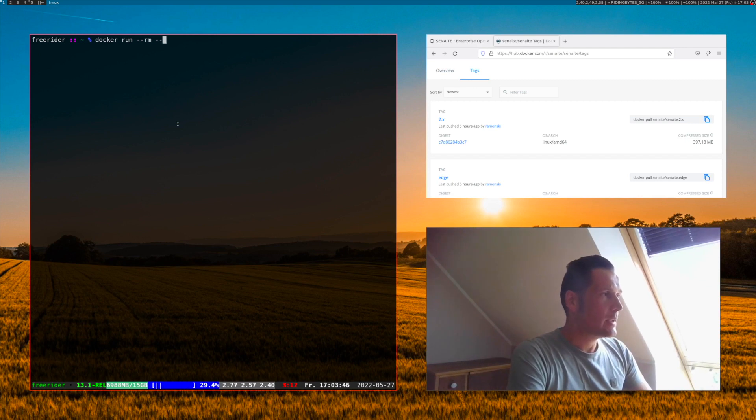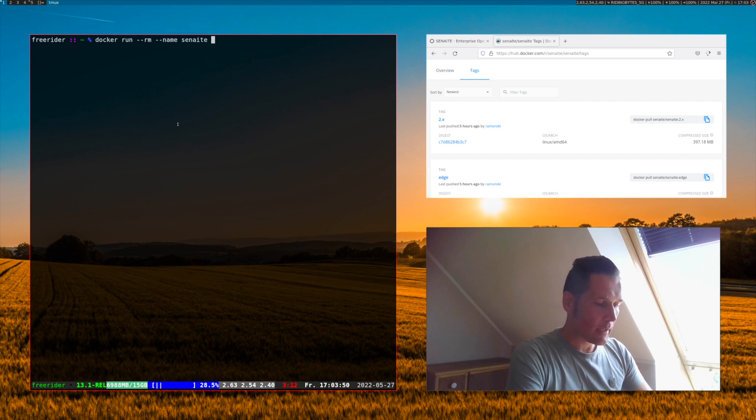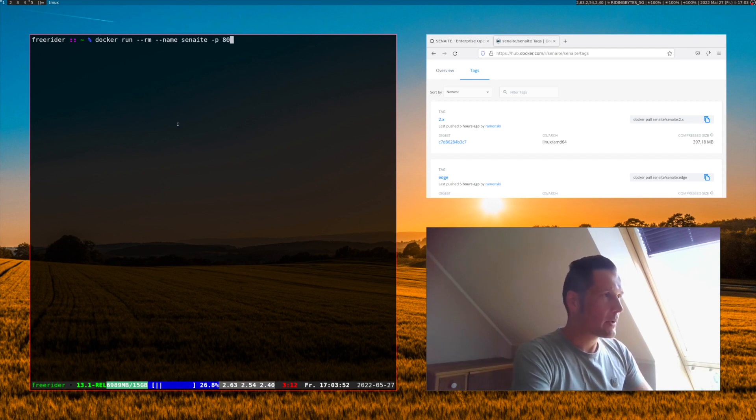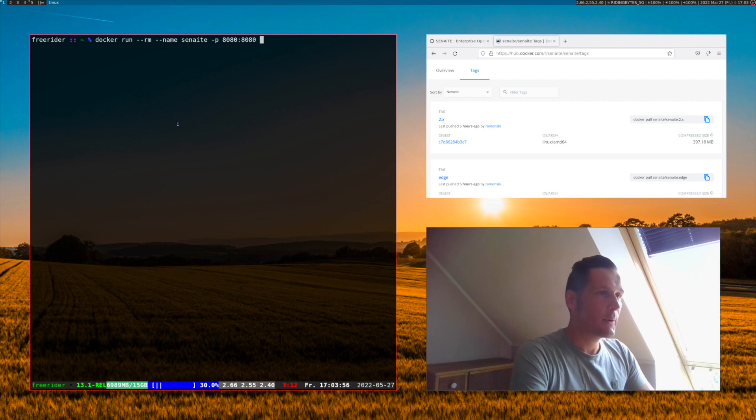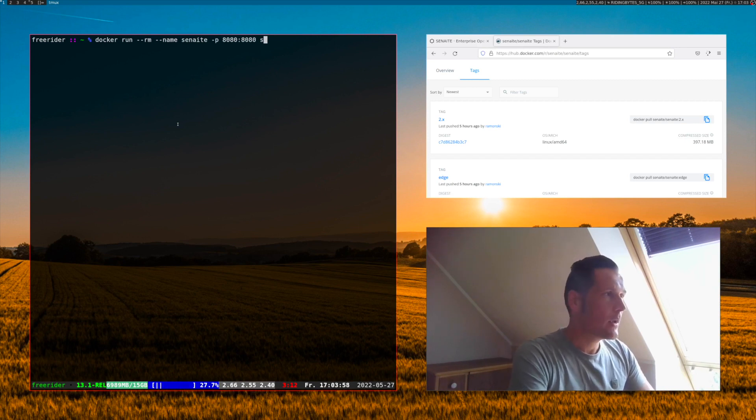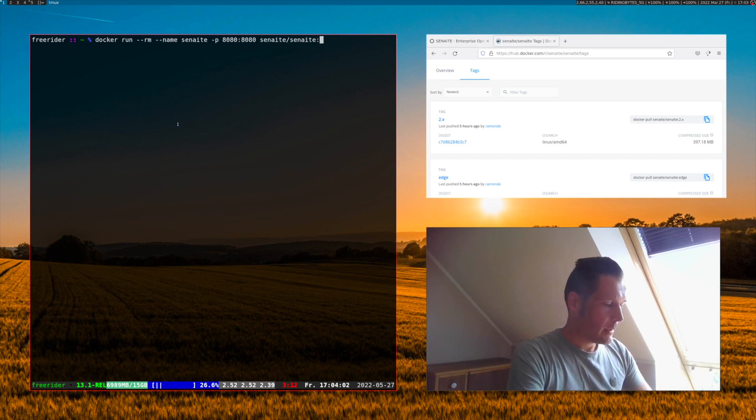We would like to name the running container senaite and we would like to use port 8080, the same as in the container, when we access it over the web browser. And of course we need to specify the image we downloaded previously.